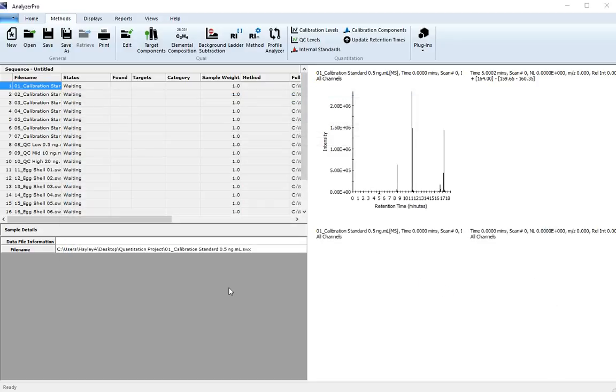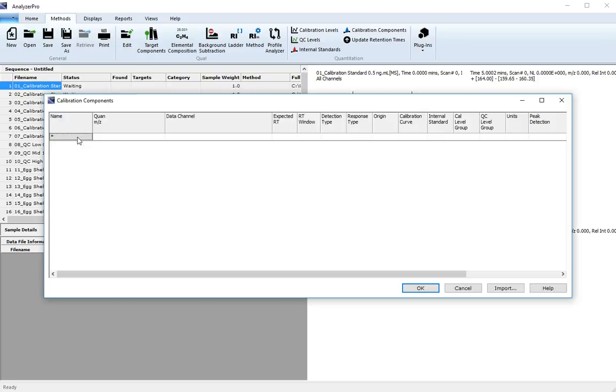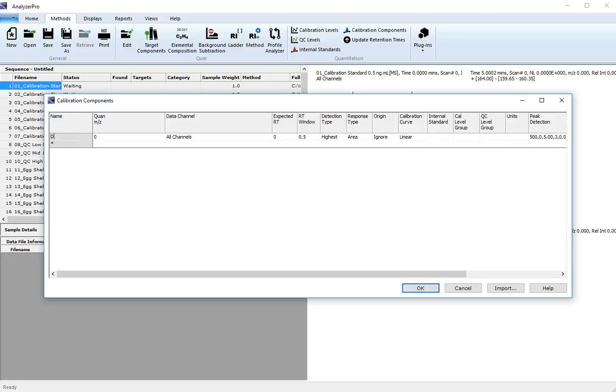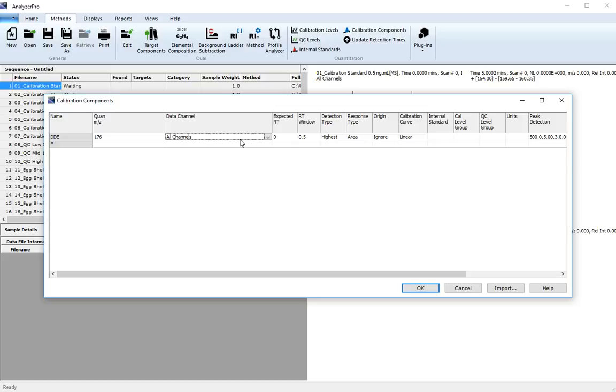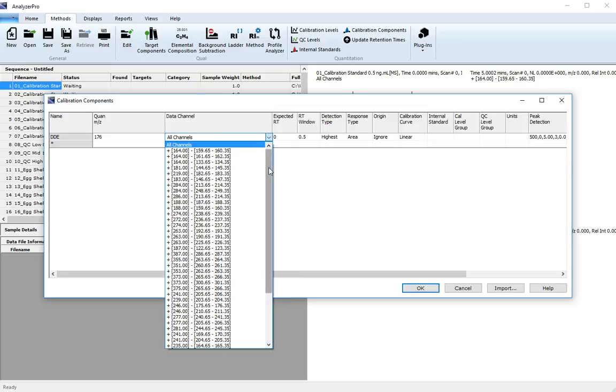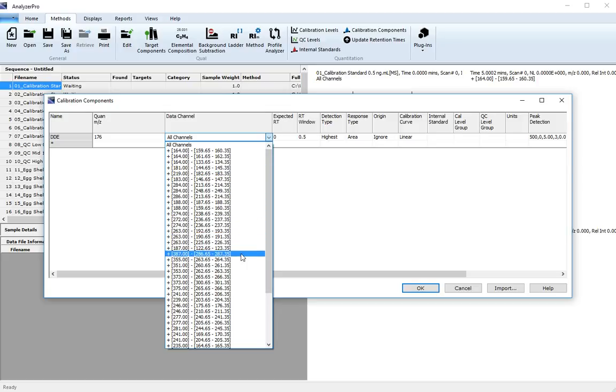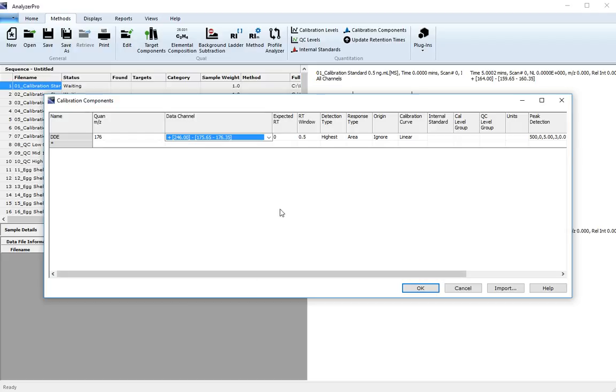It's now time to define the calibration components. The first component, DDE, will be quantified using the master charge 176 from the channel 246 to 176. The expected retention time is 14.8 minutes.